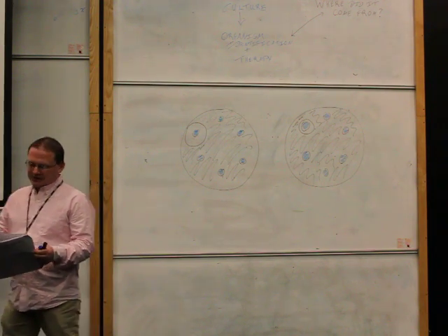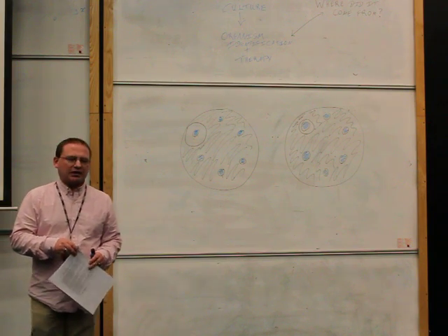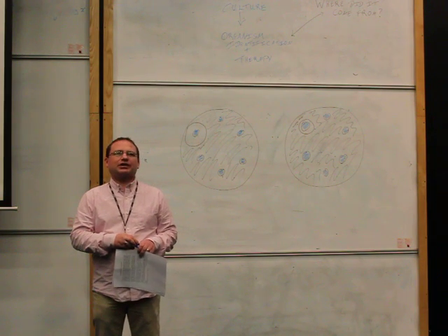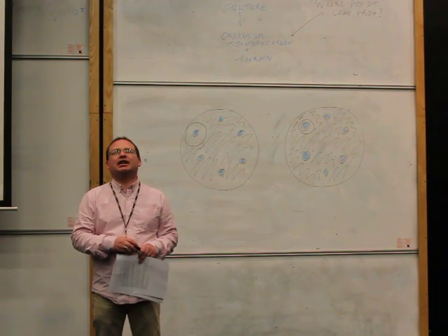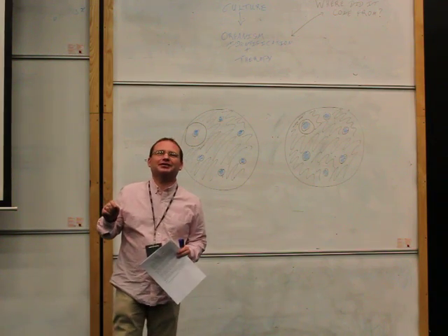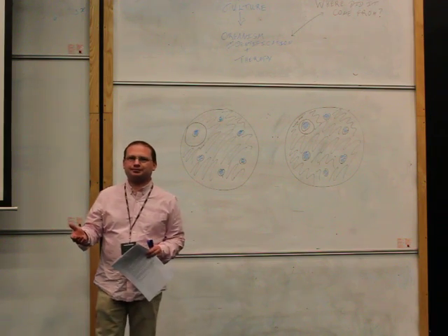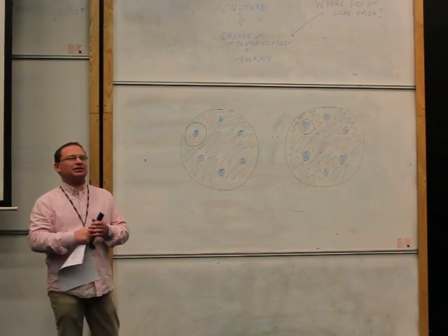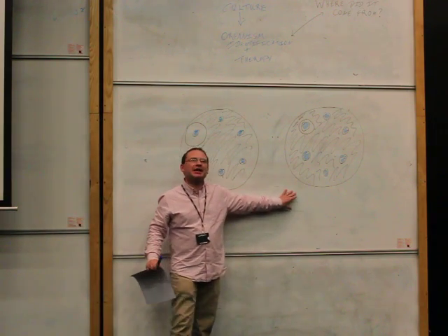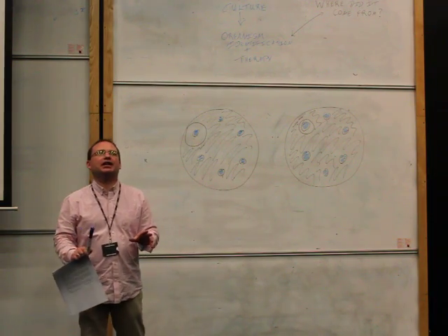So you've identified all your organisms on patient 2. One of the organisms we have got antibiotic sensitivity tests on. And again, what we will need you to do is record the antibiotic sensitivities and compare them as you did for case 1. It's exactly the same, by comparing zones of inhibition.